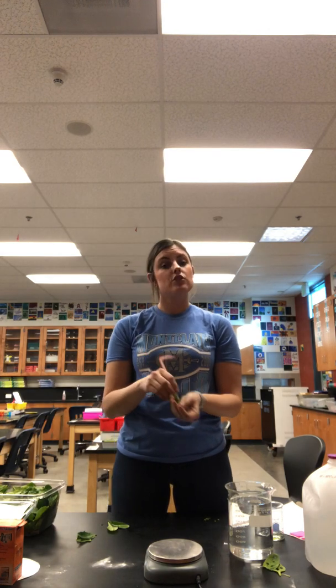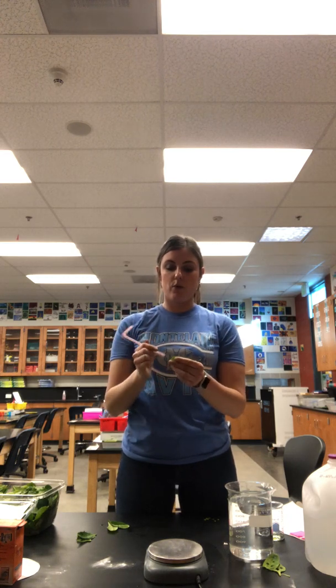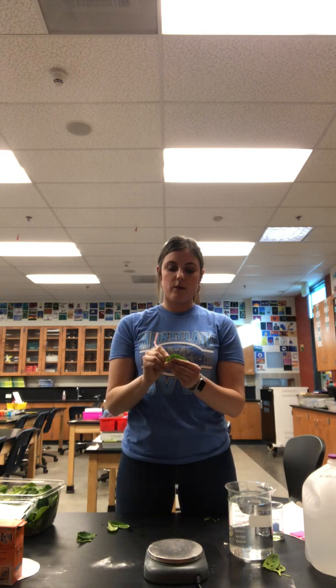Once these chads are all cut out, we're going to want to remove the oxygen from these leaf chads to get them to sink to the bottom of our solution, because we're going to measure the rate of photosynthesis by the oxygen they produce. When these leaf chads produce oxygen, they're going to become more buoyant and therefore will rise to the top. As photosynthesis is occurring, they're going to rise, and that's how we are going to measure the rate.